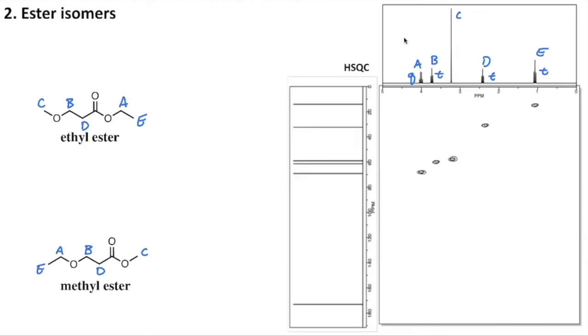All right, so now we have a feel for where our hydrogens are. We feel pretty good about that. Let's go ahead and move on to the carbons. Again, I'm going to number this starting at the highest ppm with the lowest number and give that to this carbon here, carbon 1, and then we have 2, 3, 4, 5, and 6. Let's do a quick sanity check to make sure that makes sense for our molecule. We have 1, 2, 3, 4, 5, 6 carbons. Yes, we are good. So now we can start to think about the correlations of the hydrogens to the carbons.